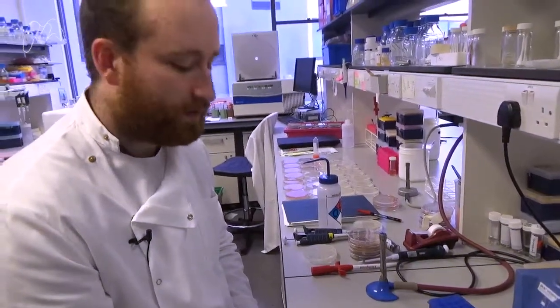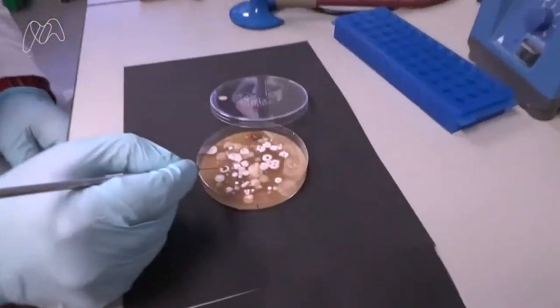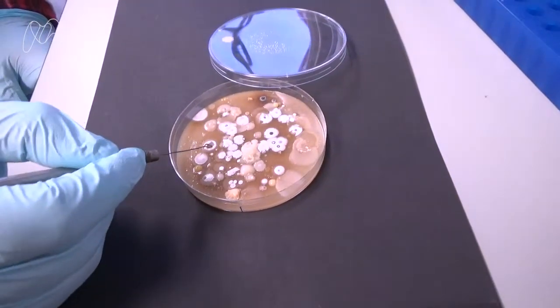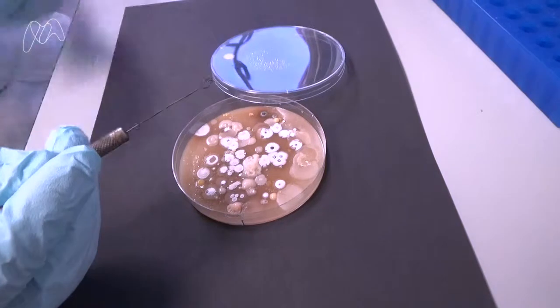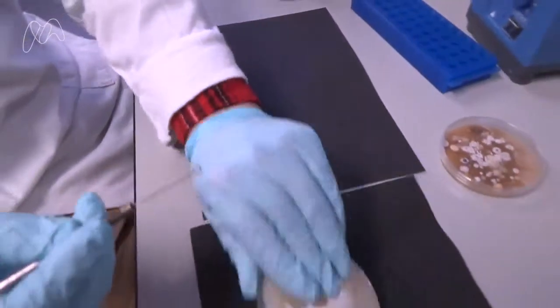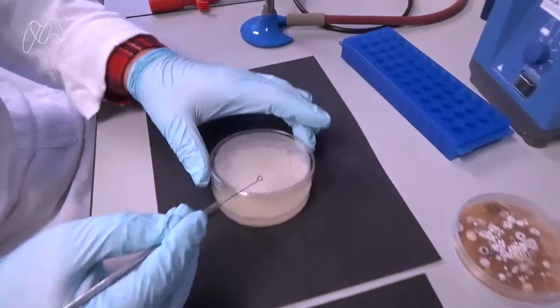After leaving a while to cool down we pick a part of the bacteria so that it's on the loop and then we put this onto a fresh plate.